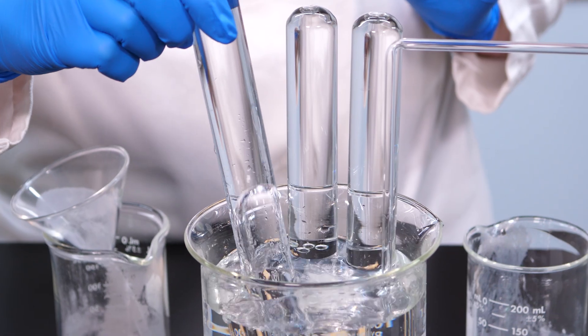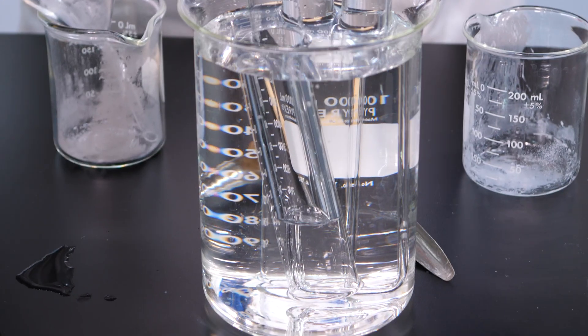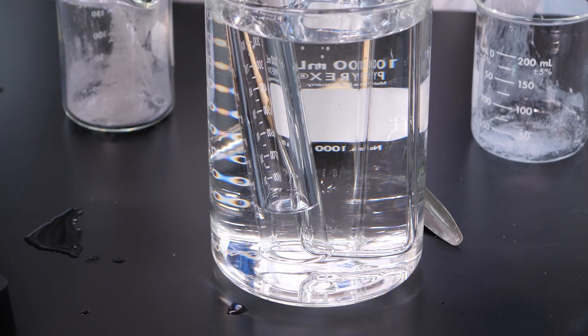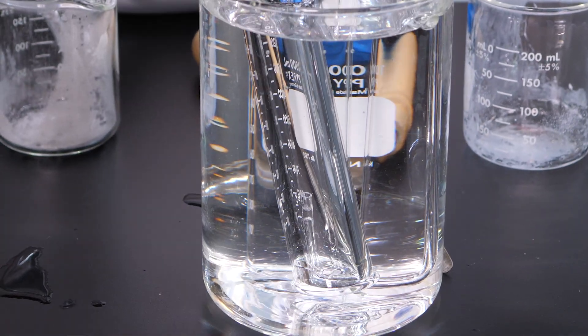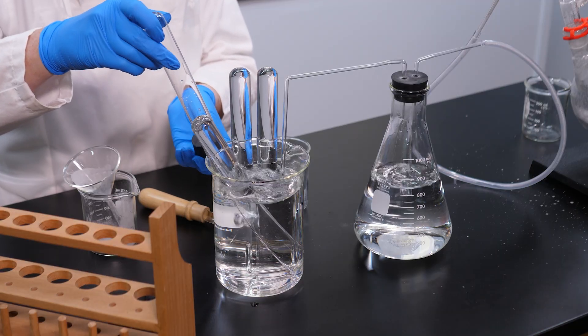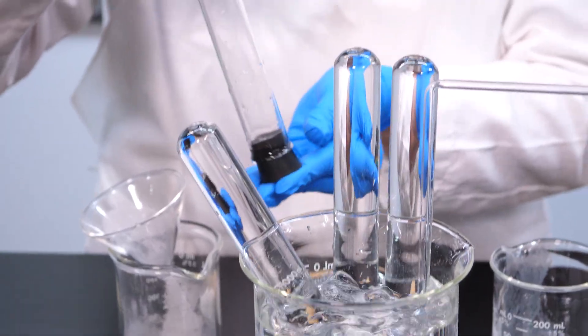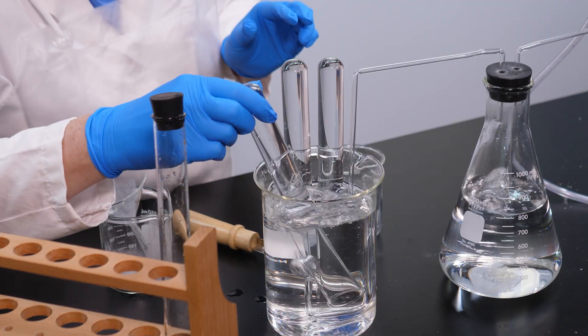After filling a test tube with water, we close off the open end and invert the test tube with the open end under the surface of the water. While keeping the open end of the test tube under water, we move the test tube until it is directly over the glass tube. The bubbles of hydrogen gas displace the water in the test tube. After all the water has been displaced from the test tube, we lift it out of the beaker and close it off with a stopper. We repeat the process with three more test tubes.